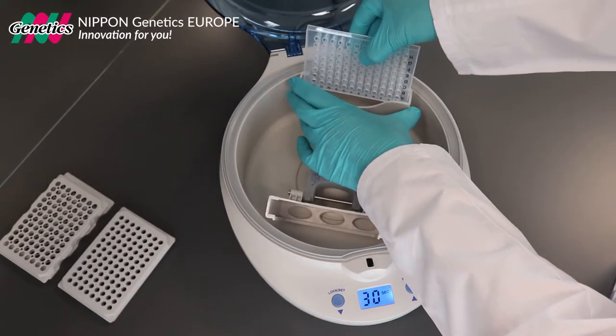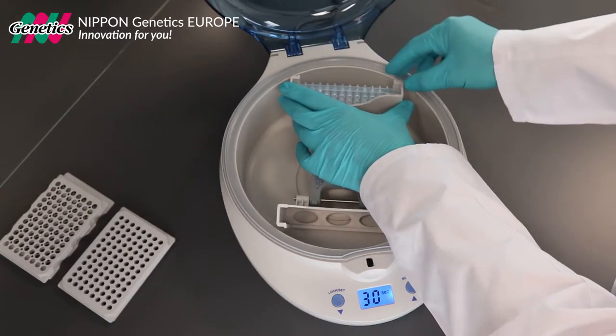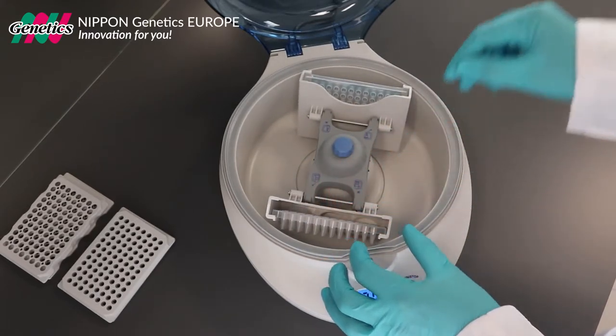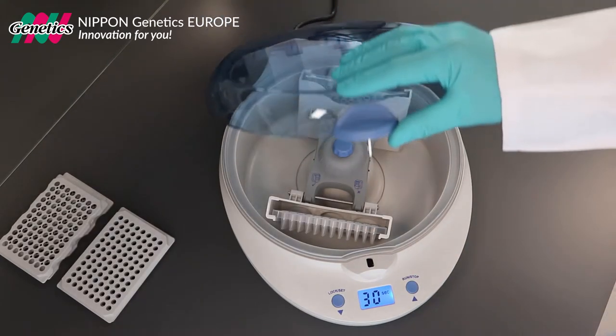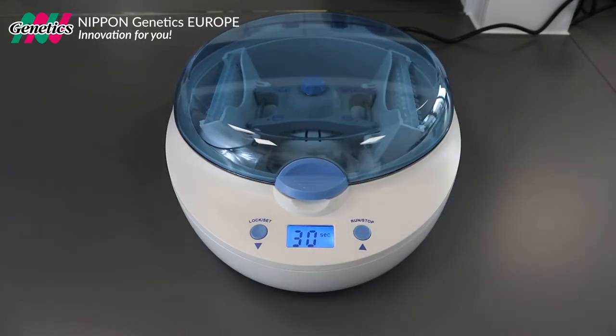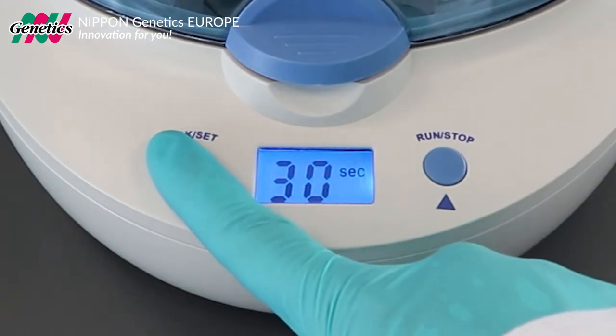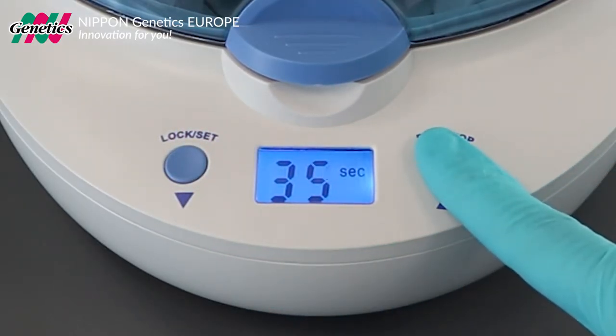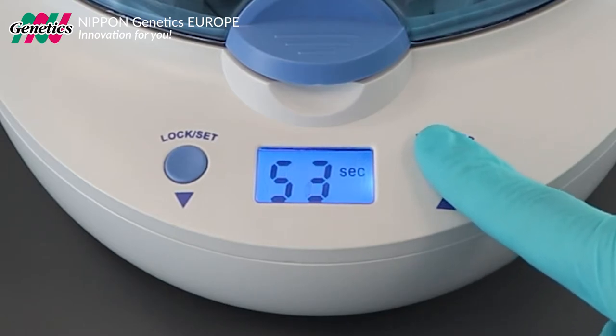Place your plate in the plate carrier together with a balanced counterweight. Close the lid until you hear it click. Press and hold the lock set button until the display starts blinking, and set the centrifugation time by using both up and down buttons.